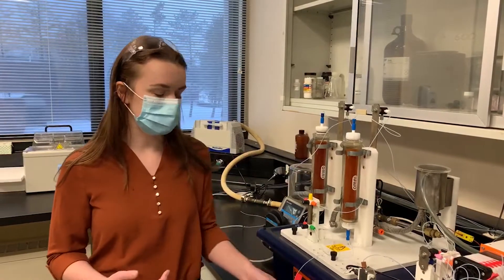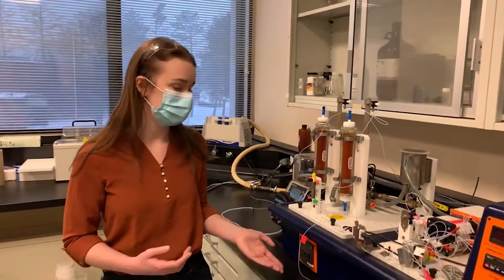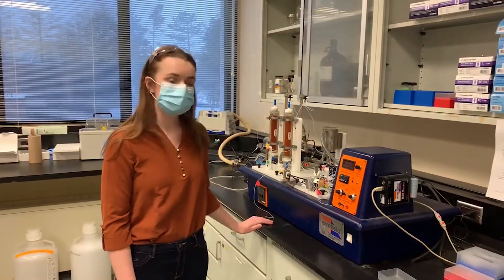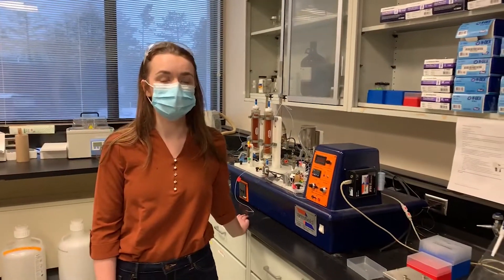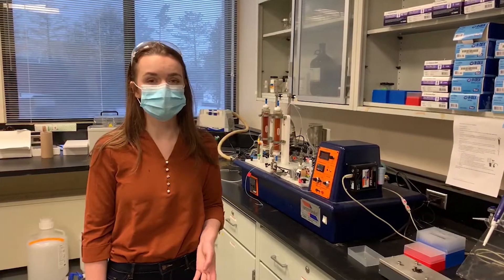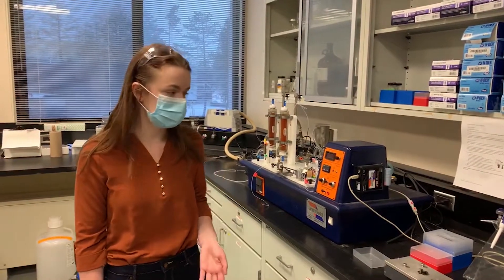You would feed your solution in through the reactor, it would react, and you would be able to collect your samples at the end to test for things like your conversion. The whole point of that lab is to look at how different parameters like your feed flow rate or your catalyst particle size are going to affect the conversion of your reaction.